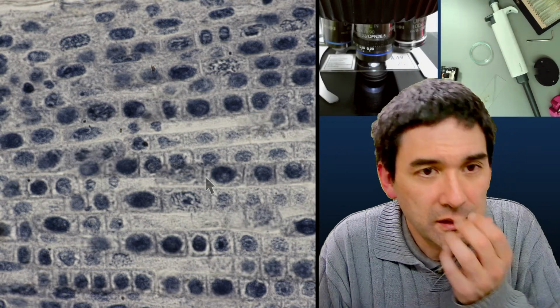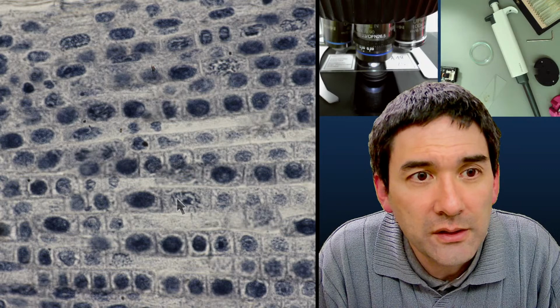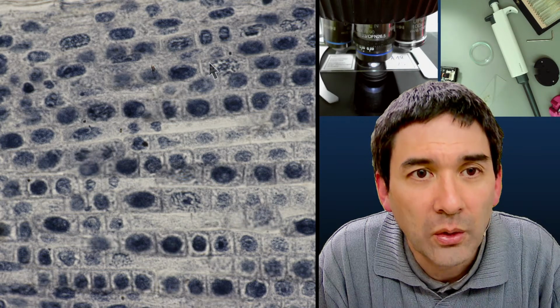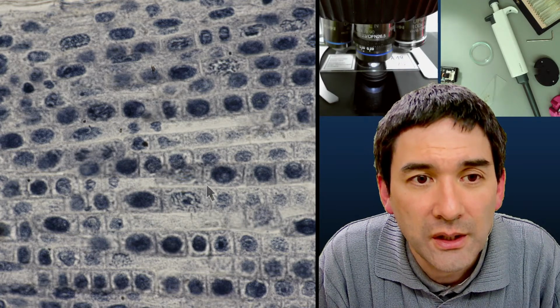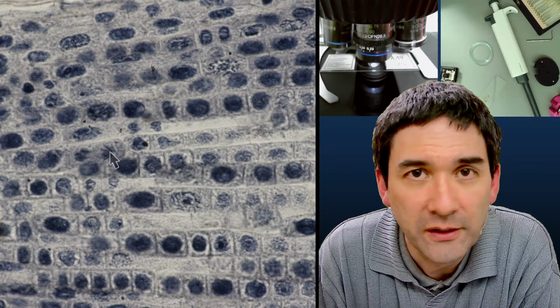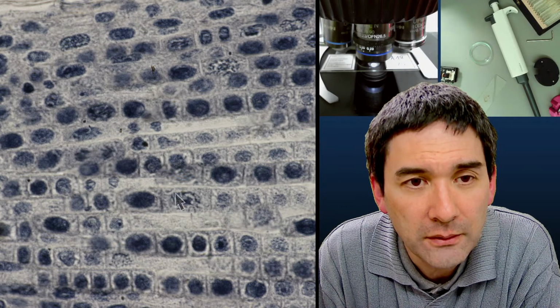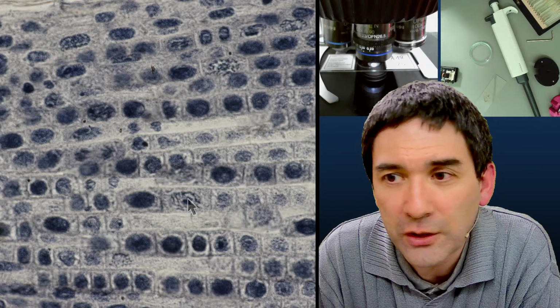Okay, so what you see, these are onion cells. Each box here is a cell, but those tiny lines in here, these are chromosomes. For example, this cell over here is dividing in anaphase. Those tiny lines that you see over here, these are chromosomes. Also over here, chromosomes, those tiny lines in here, those tiny lines up here. So yes, it is possible to see chromosomes, and this is regular bright field. With your microscope, you should also be able to see those. But this is a commercially prepared slide, so it's been specifically made for the purpose of looking at the chromosomes.